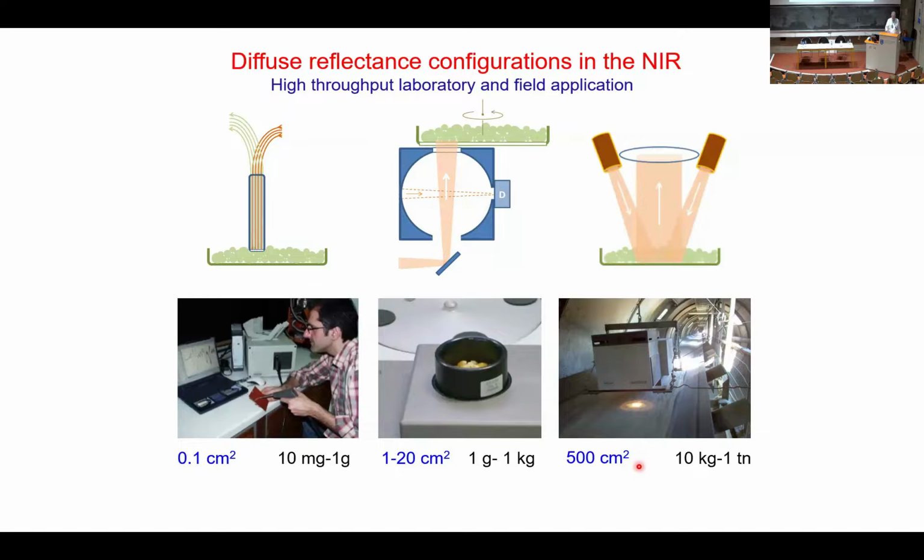And imagine that this is installed in an open air environment next to the sea. I mean, the beach is 50 meters from this, so high salinity and all these things. It's a very robust technique because you can seal it with windows, and you only have to dust it off from time to time, and that's it.